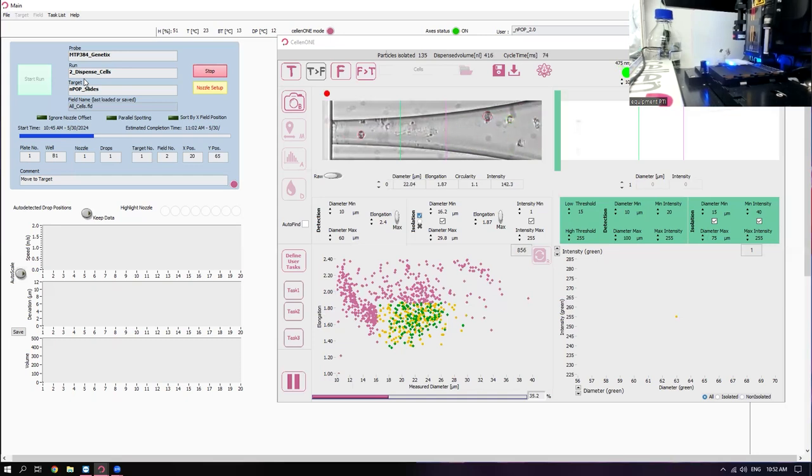But yeah, it's one of those interesting properties of water or DMSO, but essentially it allows us to... We really don't see a whole lot of effects of slight evaporation or condensation as long as the droplets don't merge. If the droplets dry out completely, we see a small loss in the number of peptides identified. But even that doesn't seem to be a big deal. And you'll have records of all that anyway.